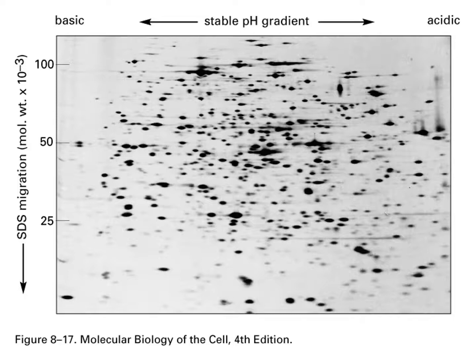So now you can have the imager, actually kind of like a bingo card, obviously more than a bingo card, but each spot has its own place. And so you can look at all sorts of different diseases, situations, drug treatments, and just look at the grand scheme of the protein production in those cells. And then you can figure out some proteins that we should start studying.